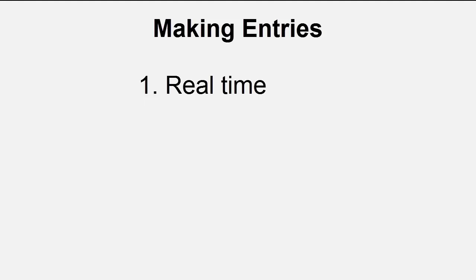The laboratory notebook need not be kept flawless. It's expected that there will be some mistakes made while you're writing in the laboratory notebook. The important thing to remember is that you do not scribble out any mistakes, but rather cross them out with a single line and then initial and date right next to it. Now, while it's not expected for your laboratory notebook to be absolutely perfect, it is expected that all your work and everything that you write in there be legible and easily understood by anybody who needs to read it.